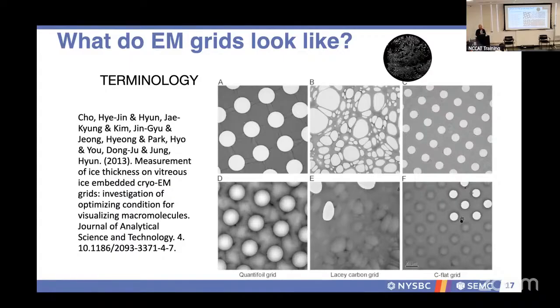And especially in the early stages, they are searching for the most compatible grid. So there are different applications. Most of the single particle work, since the sizes are on the order of a few nanometers or tens of nanometers, if your lab is only stuck using one or two types of grids, that has broad applicability. So you don't necessarily have to have a full gallery of grids if you have a very established system.